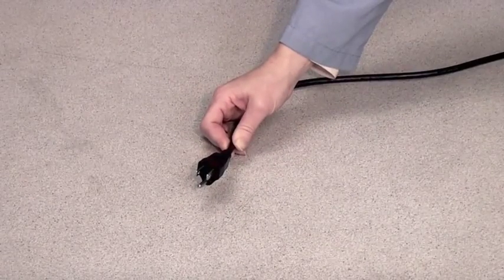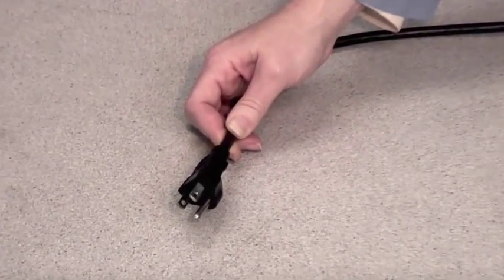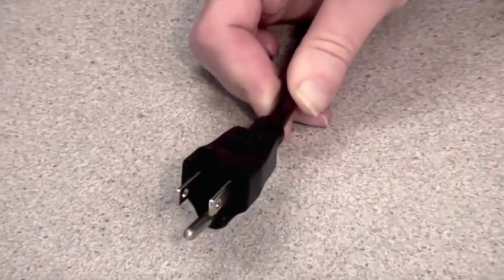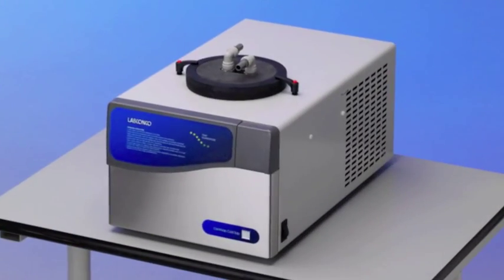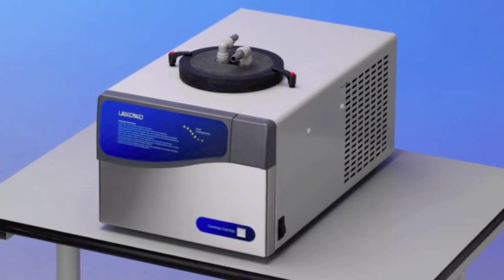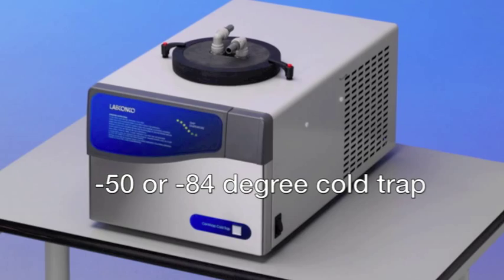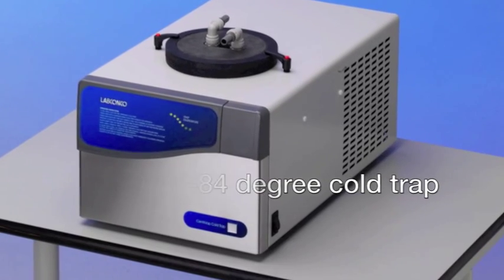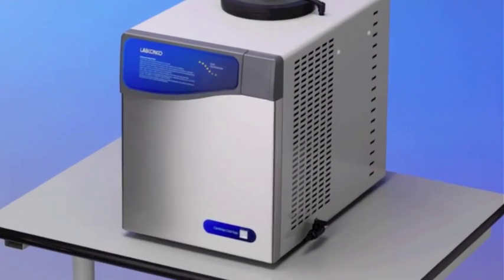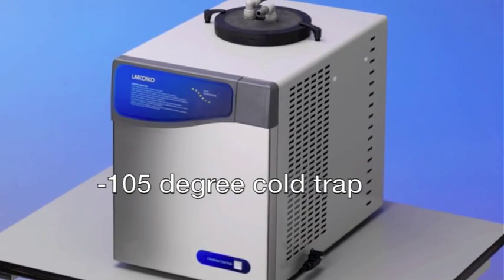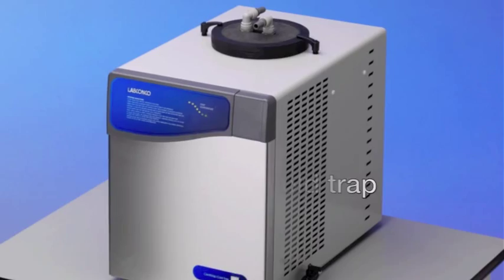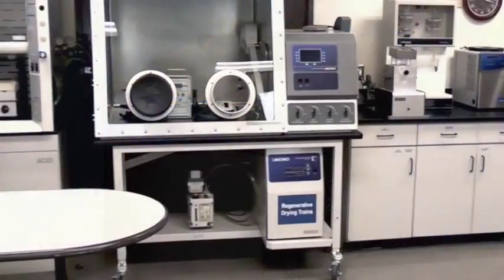The Centravap requires a dedicated grounded 15 amp circuit for 115 volt models and 8 amps for 230 volt models. The 115 volt negative 50 degree and negative 84 degree cold traps also require a 15 amp dedicated circuit. The negative 105 degree cold trap requires a 20 amp dedicated circuit. 230 volt models require a circuit rated for 8 amps.